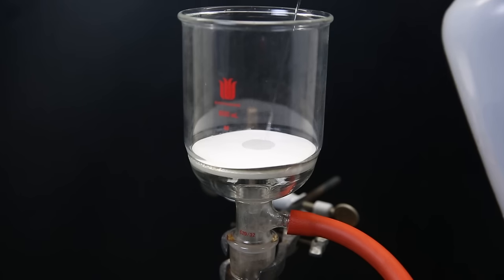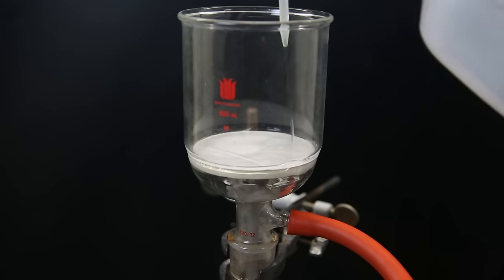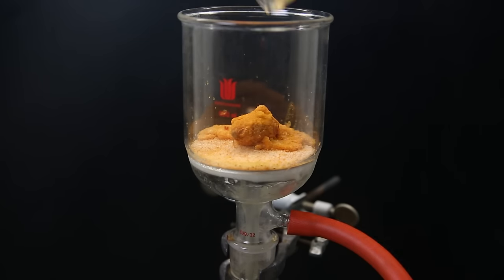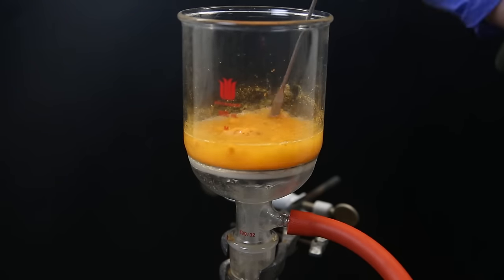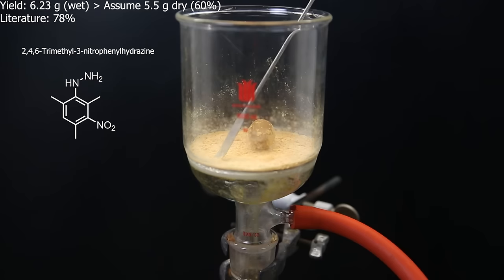I then set up a glass filter with a paper filter on top, and wet it with some water. I then pull a vacuum, and filter all of the orange mixture through. I wash it once with some water, and then twice with some ether, which washes out pretty much all of the orange stuff. I was then left with 6.23 grams of a wet, light yellow solid, of which I assume the dry weight is 5.5 grams.